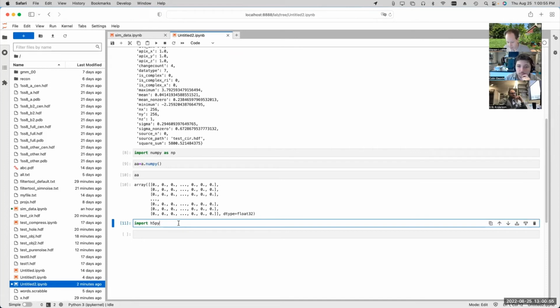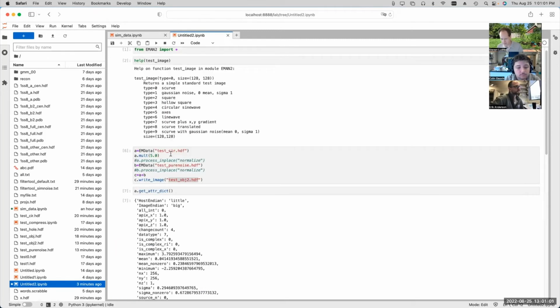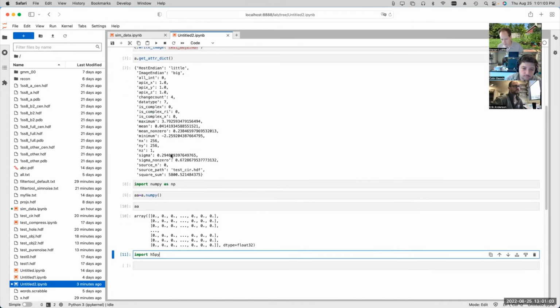Anyway, I wanted to clarify that because someone asked a question about it, and I thought it was important to understand what was going on here at least a little bit. So, you get a neural net out after your training, in the segmentation procedure for EMAN2. Is that an H5? I feel like I've seen that.